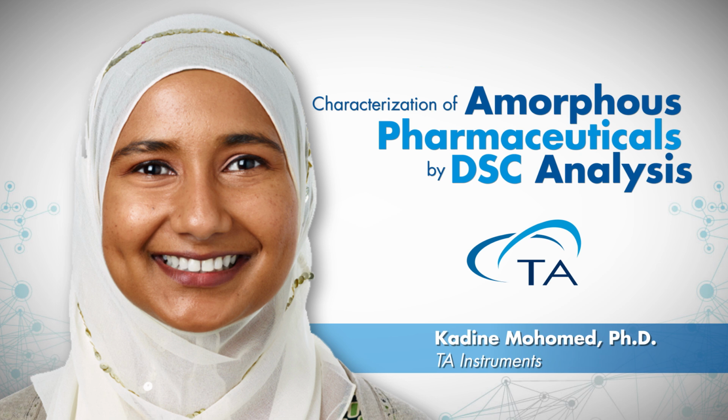You should never load a DSC pan at subambient temperatures, mainly because if you were to open the DSC lid and that cell has been cooled to minus 90 degrees, immediately the water in the atmosphere, the relative humidity in the room, is going to begin to condense and then crystallize. So you're going to have freezing or frosting inside of the cell from the water that's in the air. So always place your sample pan into the DSC cell at room temperature and then perform your equilibrate to subambient temperature program.